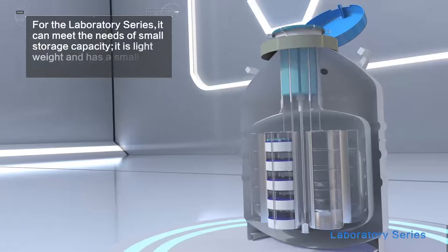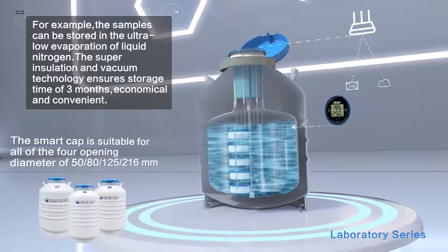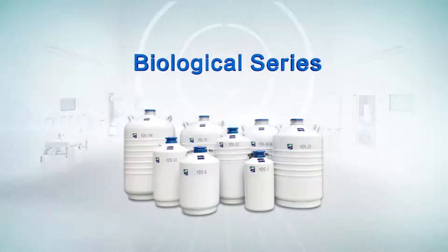For the Laboratory Series, it can meet the needs of small storage capacity — it is lightweight and has a small footprint. For example, samples can be stored in ultra-low evaporation liquid nitrogen. The super insulation and vacuum technology ensures a storage time of three months, economical and convenient.